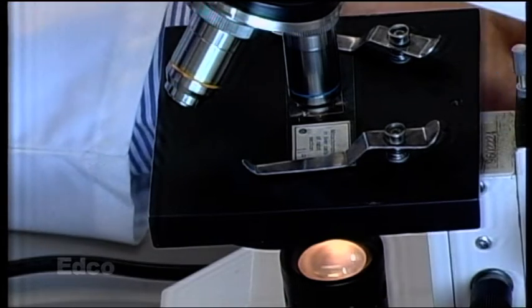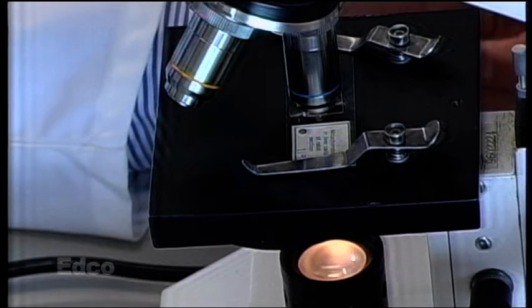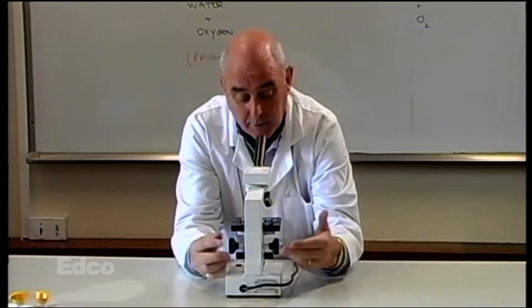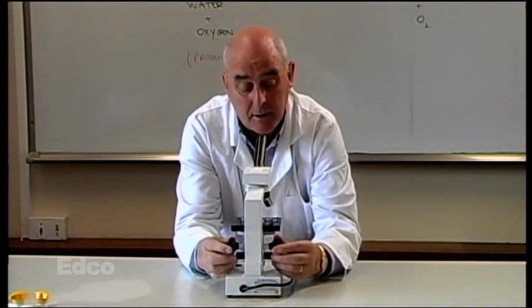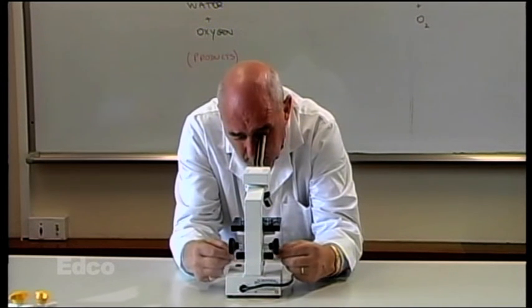And again, this time, fine focus. For the high power lens, fine focus. The danger would be if you use the coarse focus, you would crack or damage the slide, and in fact maybe even damage the lens. So fine focus in this case, and the image should come into focus.